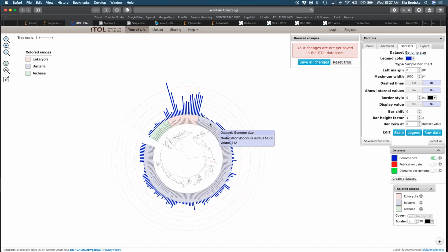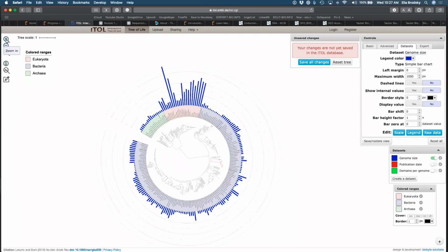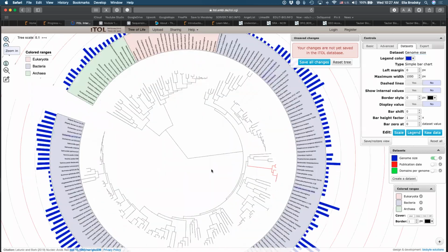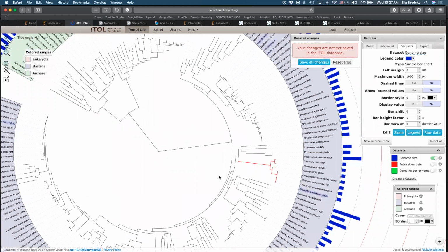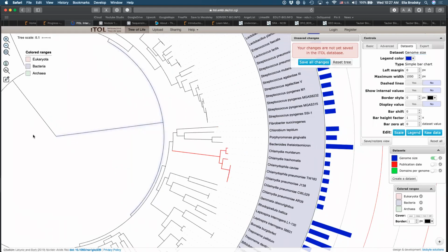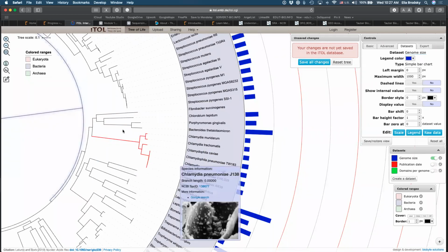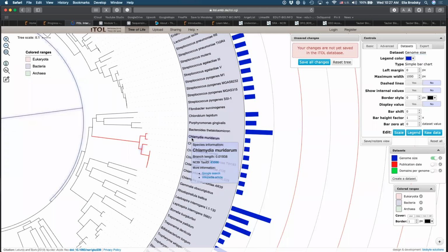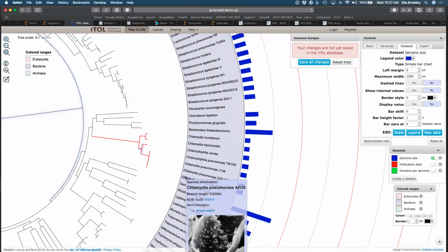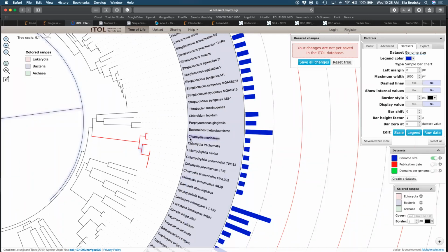Okay, so where is the bacteria? All of the purple ones are actually bacteria. So let's take a look at some of this bacteria. Now we can zoom in. Okay, and let's take a look at one particular example, just so that we understand this concept of similarity. Here I've identified this little clade of this phylogenetic tree. If you can find chlamydia, you'll see a number of different chlamydia members in this portion of the tree. Okay, so how many of you have found chlamydia?